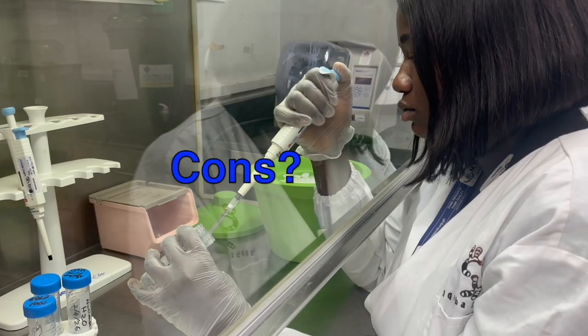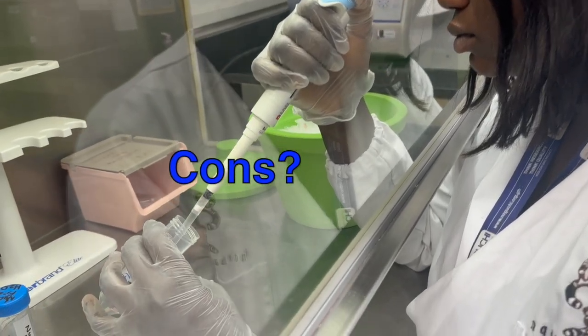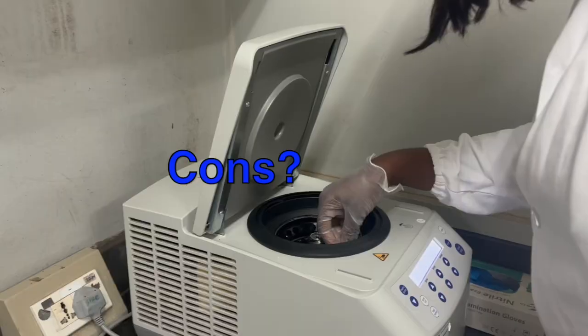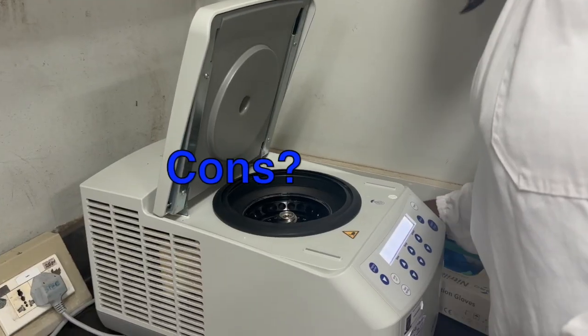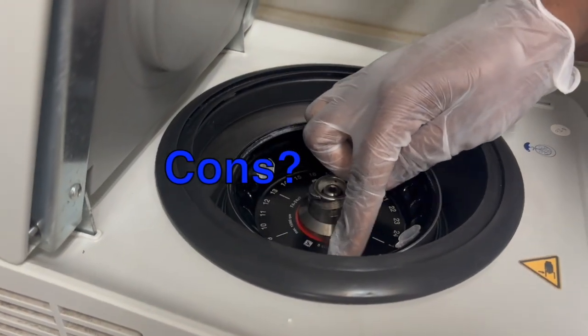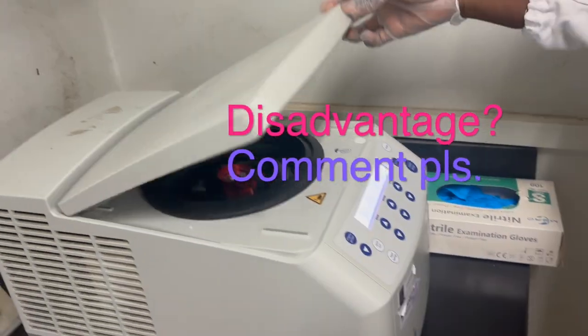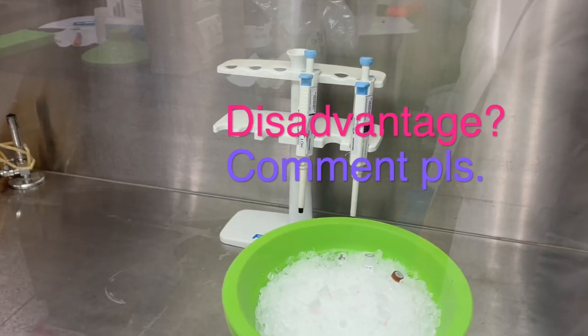So just like before, where as you get more data, it's more expensive, the same thing happens here, because depending on the size of the transcriptome, you may be looking at a lot of genes. And also because you're just sequencing everything, you're getting more data, it tends to be relatively expensive. But can you think of a disadvantage?